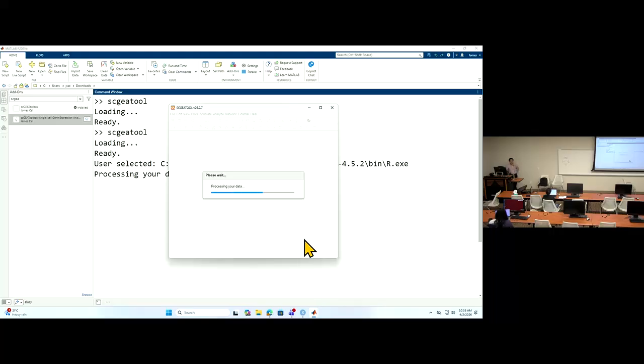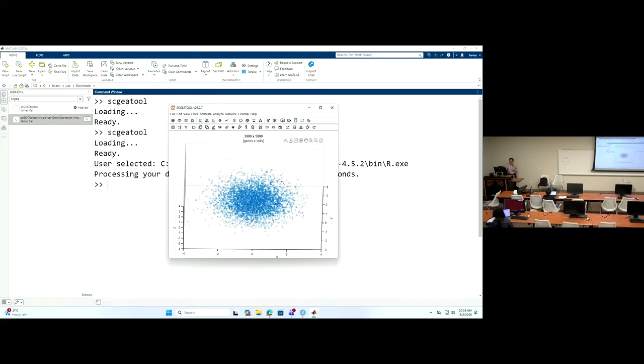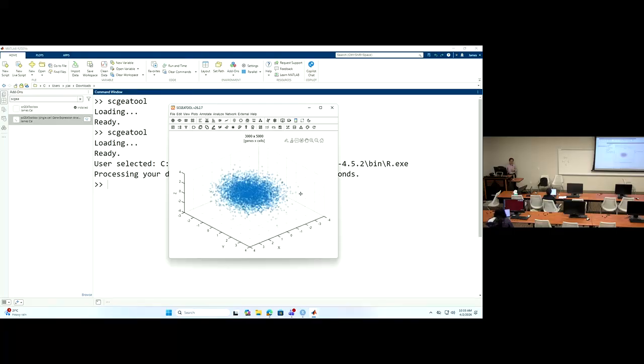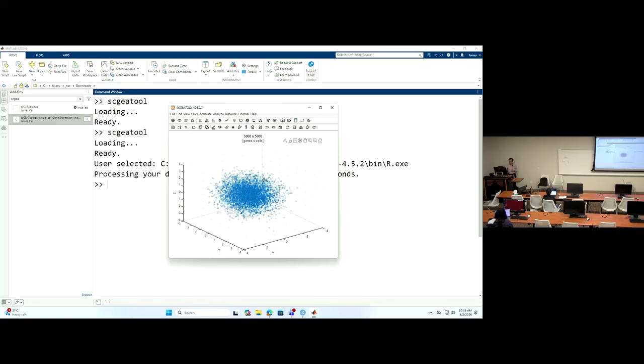This is a very simple simulation, where random numbers generate random cells that follow some distribution, negative binomial, we talked about that. I want to show you this because we know those cells are a homogeneous population with no structure.